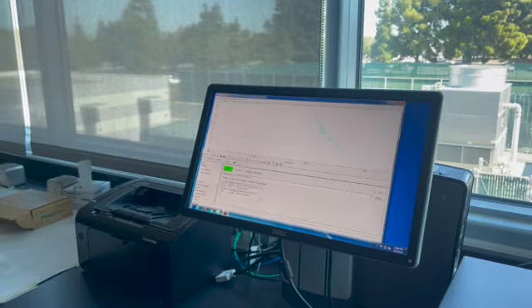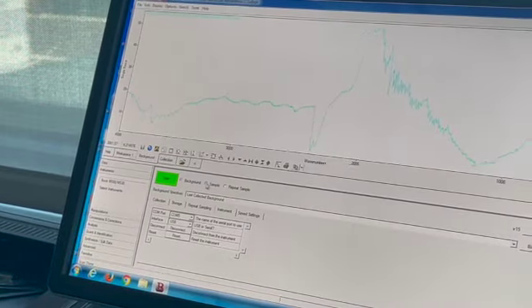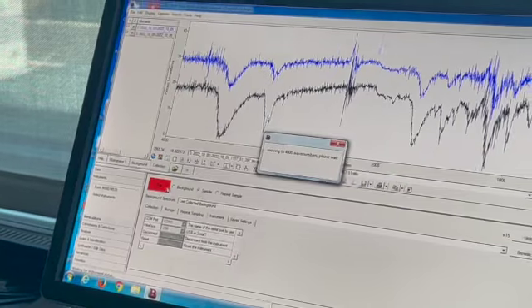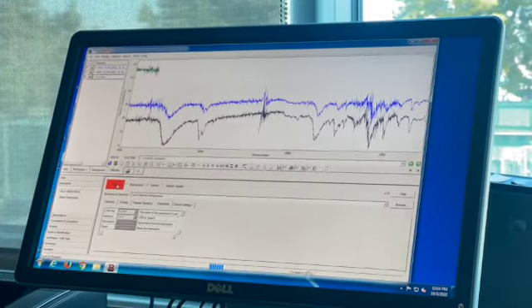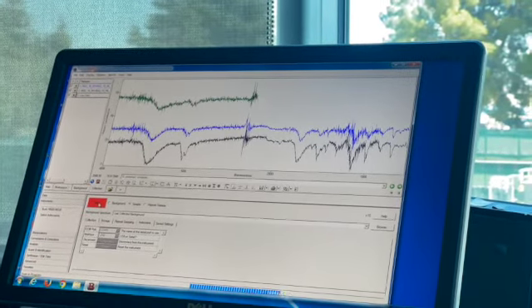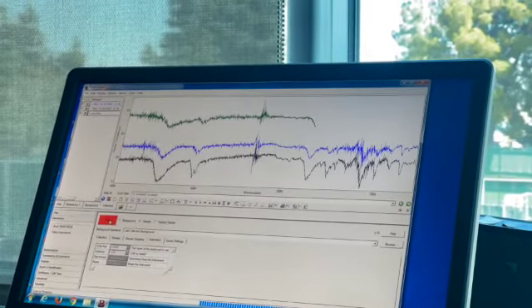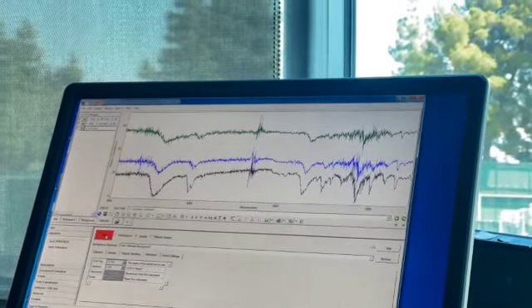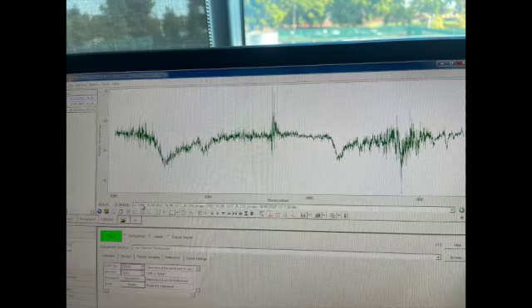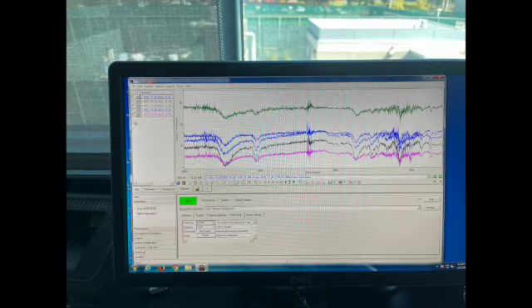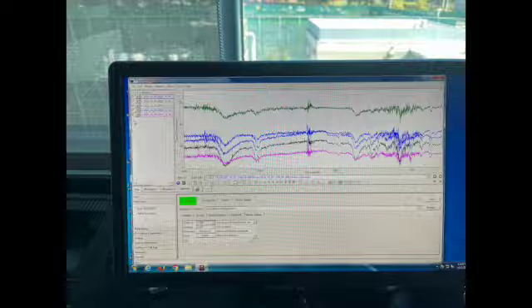Now we're going to switch our program to sample setting, and then we're going to click start to read our sample.